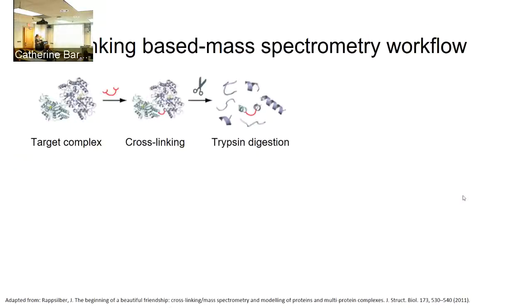All right, so after we have our two subpopulations, we go into the standard mass spec preparation, where we have to lyse the cells, purify the protein, and digest it so that we have peptides that are small enough for mass spec.